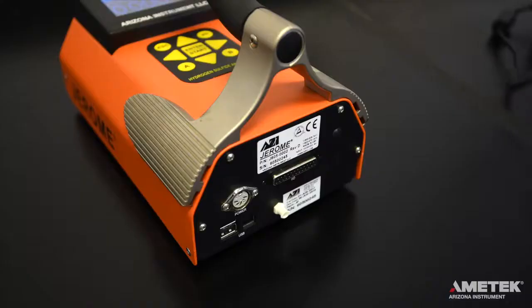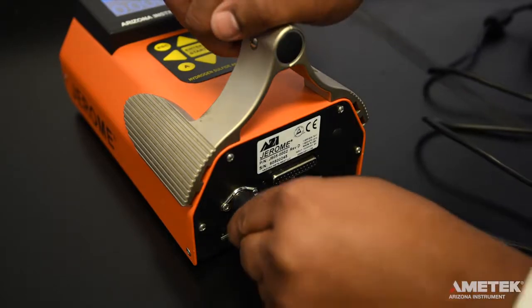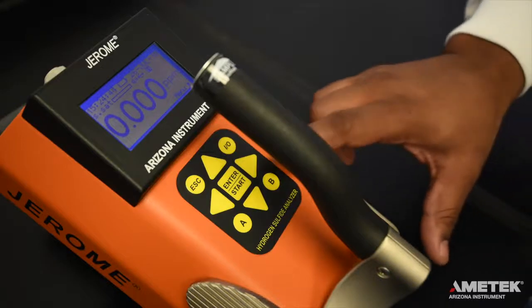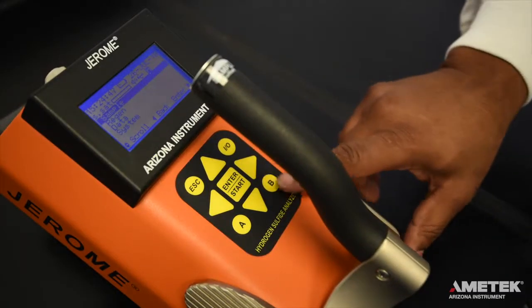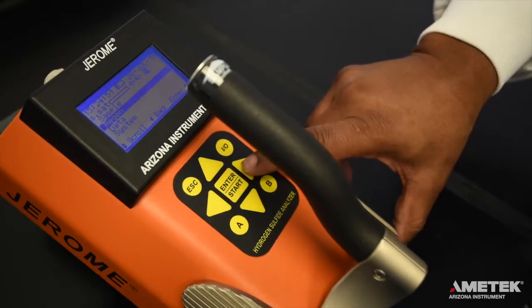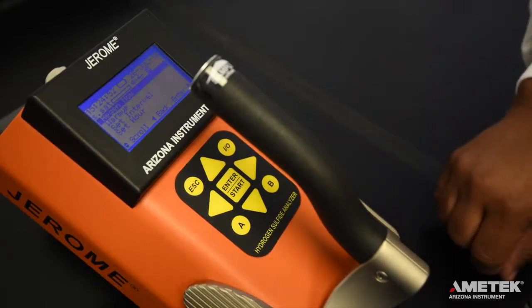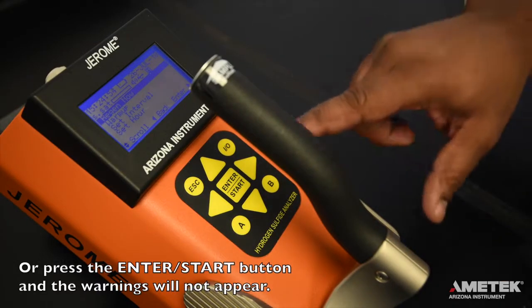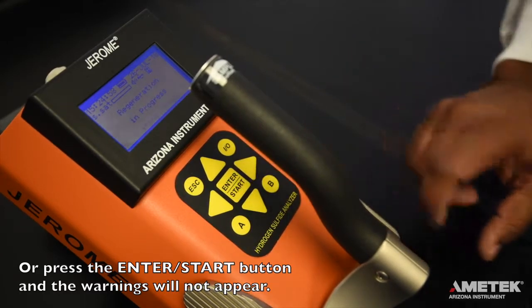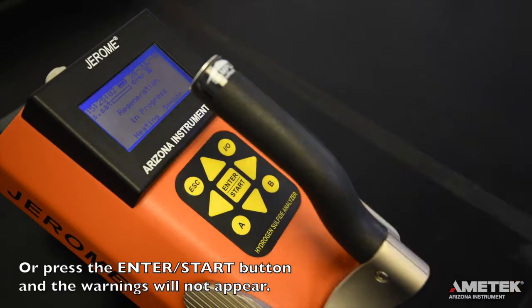To perform a regeneration cycle on the J605, plug the instrument into the line cord and AC adapter or the optional external battery pack. Press the right arrow button to enter the main menu, then press the down arrow button to move the cursor to regen and press the right arrow key to enter the regeneration menu. Press the right arrow to select regen now on the regen menu. When prompted to confirm your choice, press enter to proceed or press escape to cancel. Read the warning that appears, then press enter to proceed or escape to cancel.